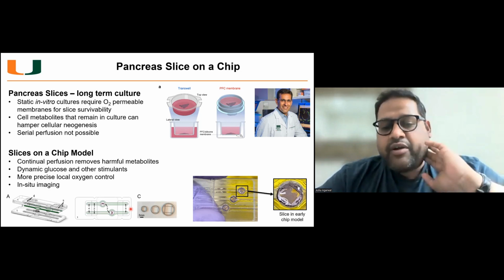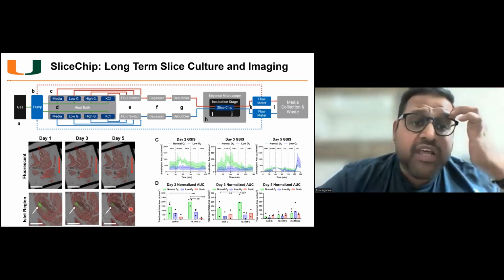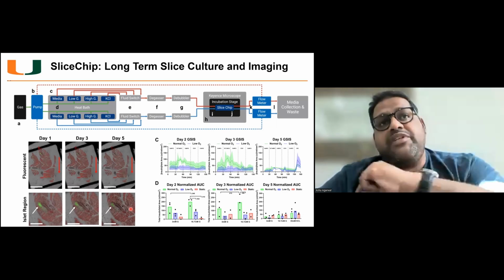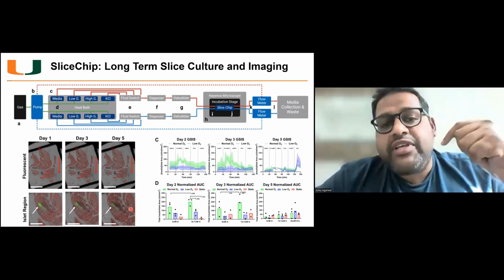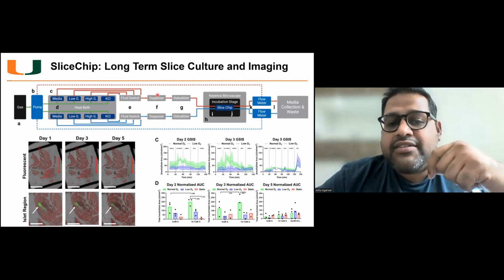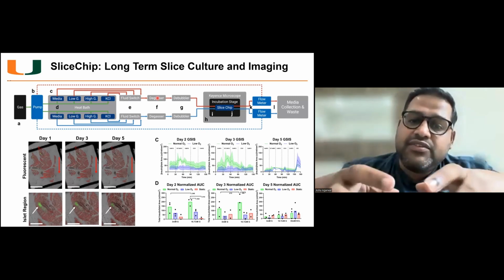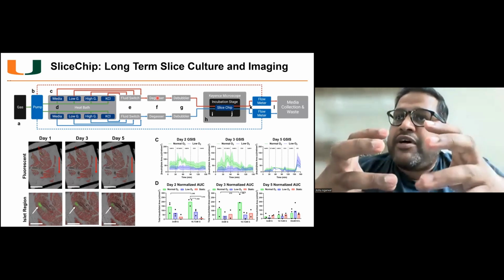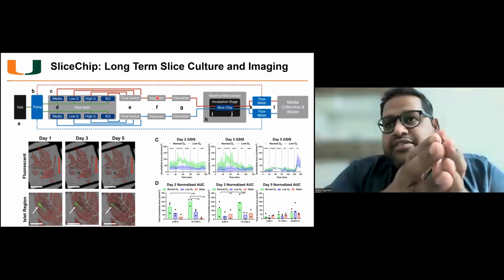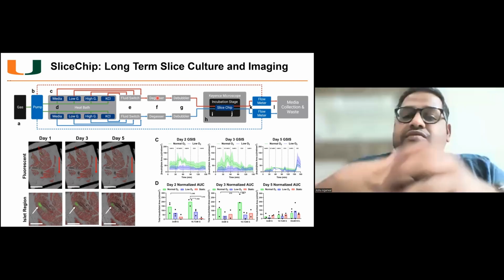So that project turned out to be a longer challenge, and we just published this in Lab on a Chip last month, where it turns out that if you have so many temperature changes in a microfluidic device, you've got air bubbles, and really the only robust way of eliminating air bubbles is to use a degasser. So really take out all the resident gases that are dissolved in your liquid. Because when your solution rises up from room temperature to 37 degrees Celsius, the gas solubility decreases. And when the solubility decreases, the gas partitions out in the form of air bubbles.